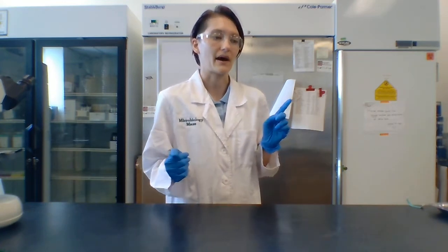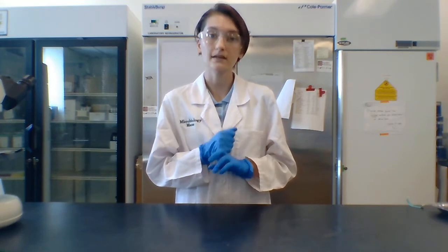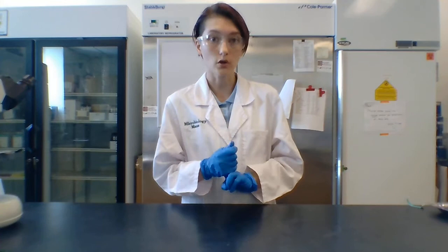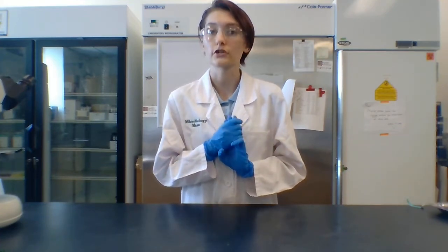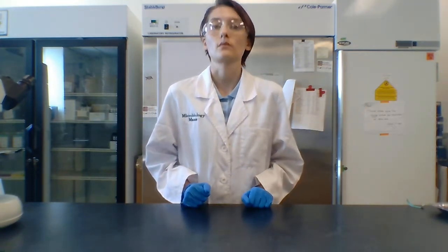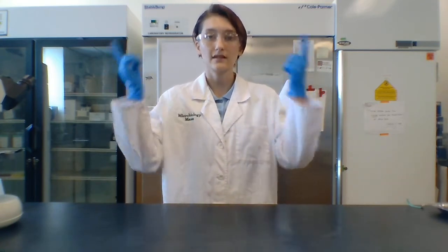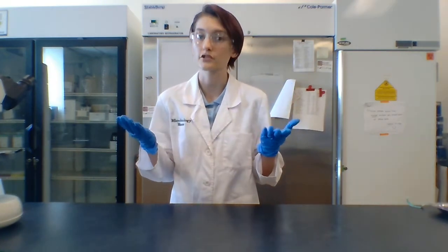We're going to talk about how to prepare for a lab safely and keep things sterile. We're going to talk about how to take a culture and how to examine that culture in a microscope. So, lab safety. What do we got to do? We've got our lab coat on, we've got gloves, and we've got safety goggles. And that is going to keep us safe from germs.